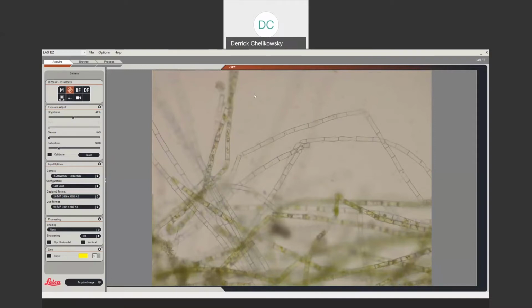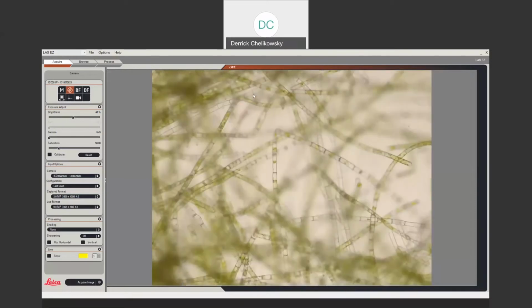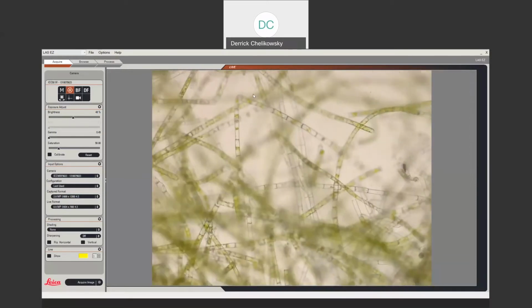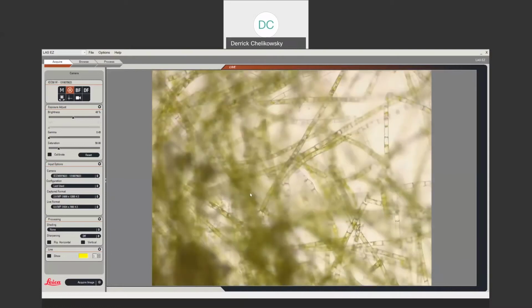Yeah, that's unfortunate that I'm not getting any really good antheridia. That right there is the beginning of an antheridia. Yeah. This right here is the beginning of one. It's not really one, but it's getting there.